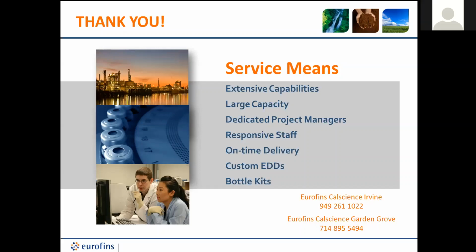I know that some labs, for VOAs, the volatile organic analysis vials, require 2 VOAs for a lot of tests, and some require 3 VOAs. In your approach, which do you guys prefer, 2 or 3 VOAs, and why?